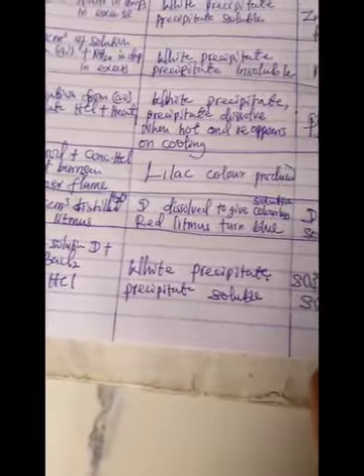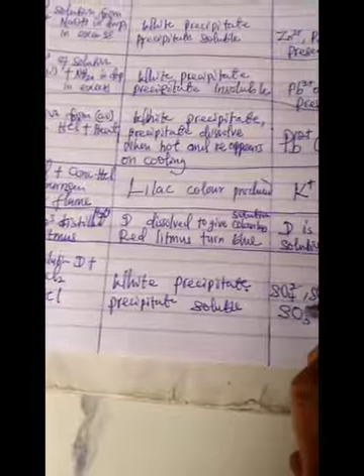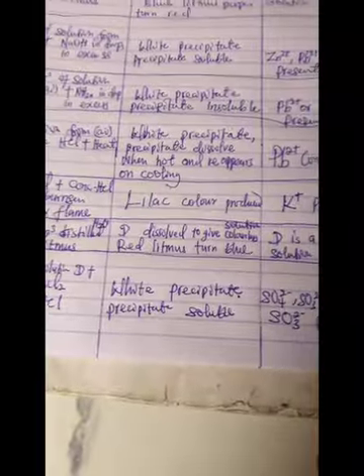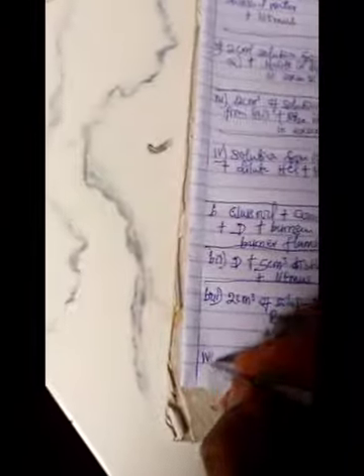Since it dissolved without effervescence, it means that SO3 2- is present. Good. Then what again? We'll now say the last one there, which is IV.